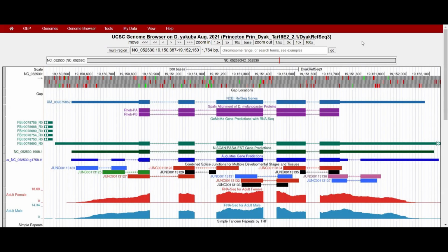Today we will pick back up on the last section of Part 6, Part 6.5. Recall that in Part 6.4 we used our spliced RNA-seq reads to confirm the coordinates of intron 1. This same annotation strategy can be used to determine the coordinates for intron 2 between CDS2 and CDS3.